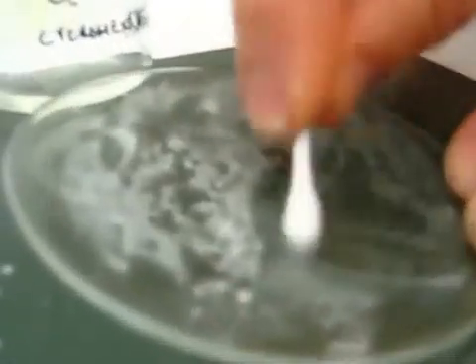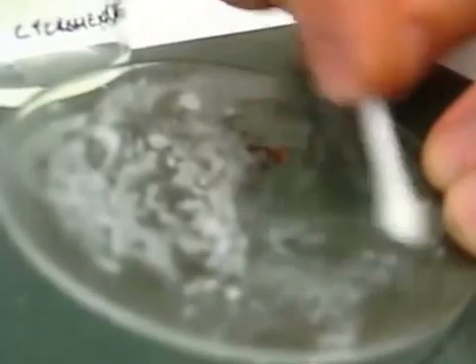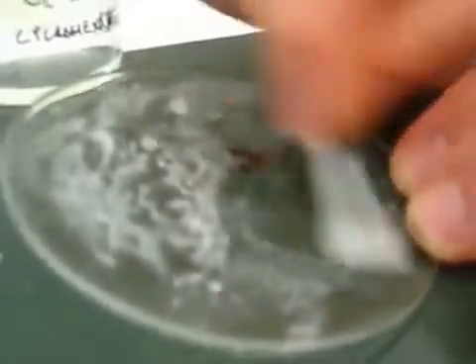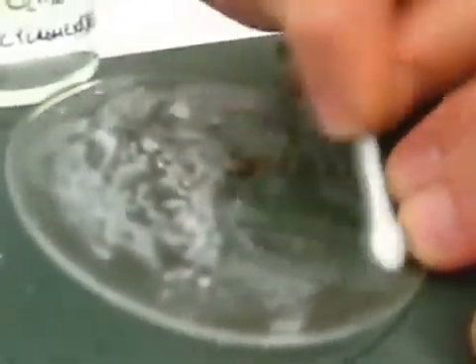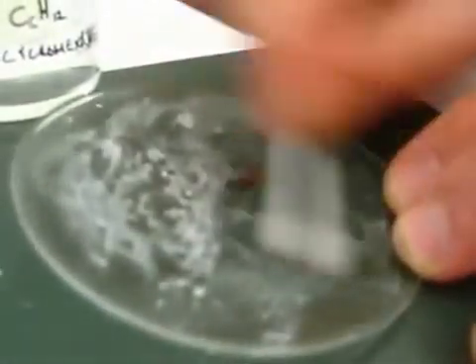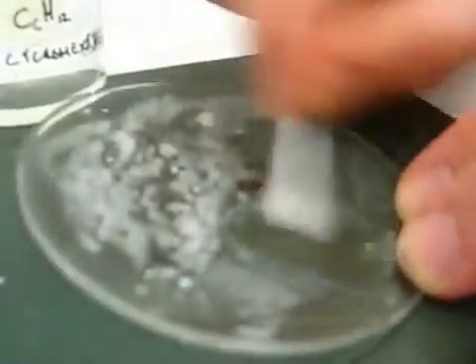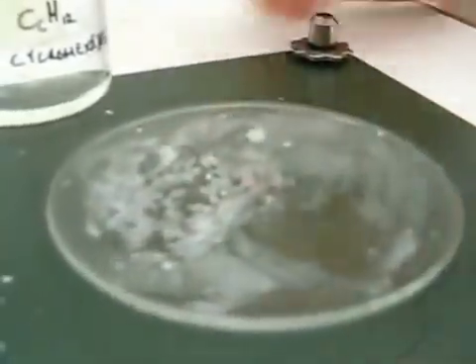It seems to melt away, which really means it's not melting, it's dissolving. It's dissolving very easily and is becoming very soft in the presence of cyclohexane. So cyclohexane actually is something we could clean this surface with less rubbing than acetone would require.